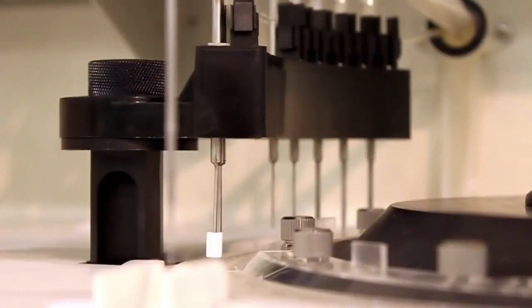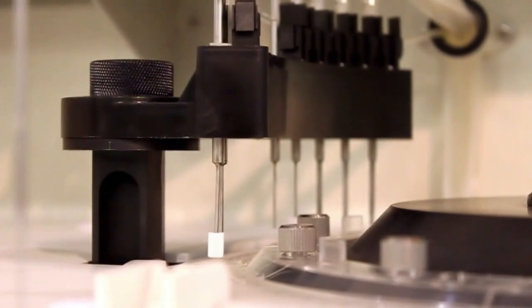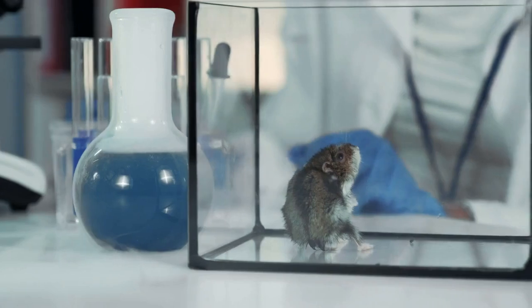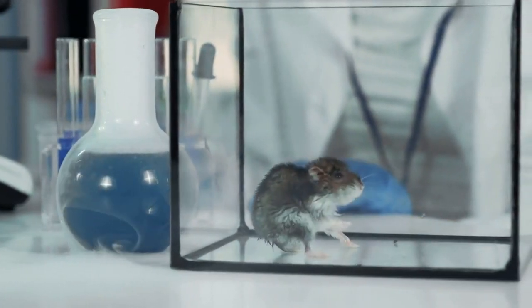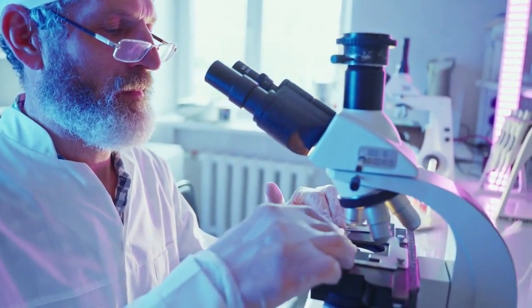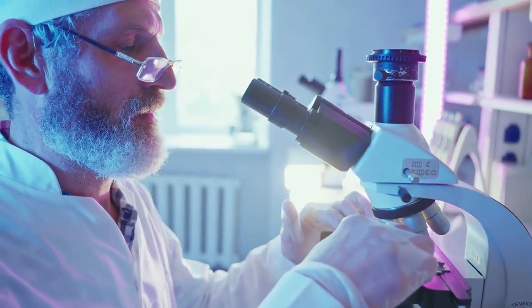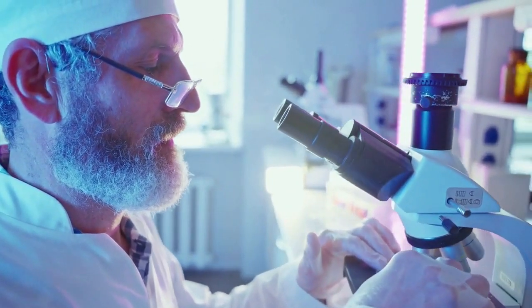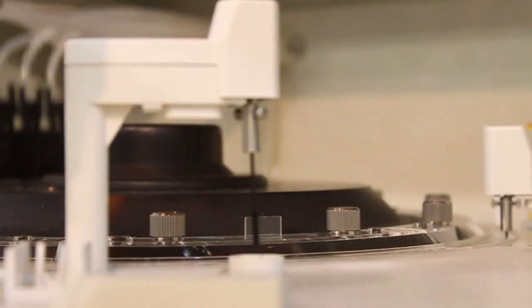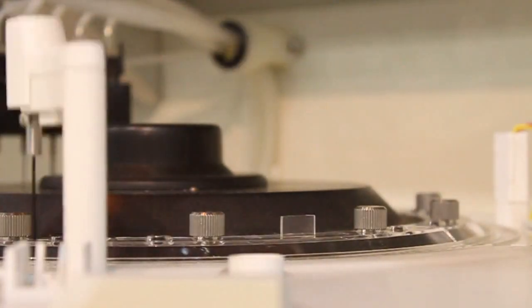A response factor, often abbreviated as RF, is a unique value that connects the concentration of a compound to the detector's response for that specific compound. Think of it as a personal conversion key. It allows us to translate the raw signal from the detector, which is the peak area, into a much more useful and meaningful value, the actual concentration of the substance in our sample. It's important to remember that every compound will have its own unique response factor for a specific detector running under a specific set of GC conditions.